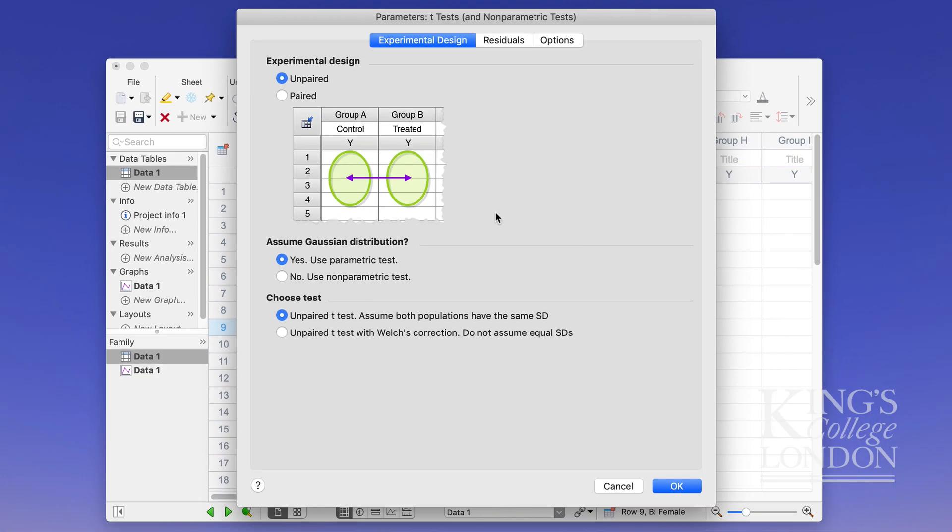So for instance row one column A or group A would represent subject one at baseline for instance and in the group B it will be subject one after the treatment. Of course a paired analysis is a more powerful analysis tool but it does require that your data are legitimately paired.